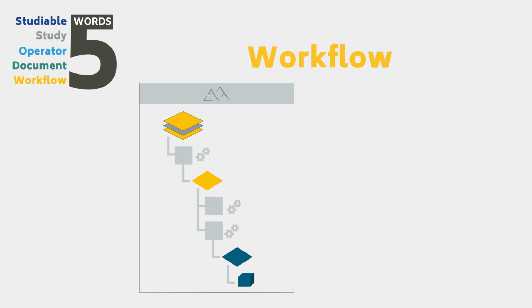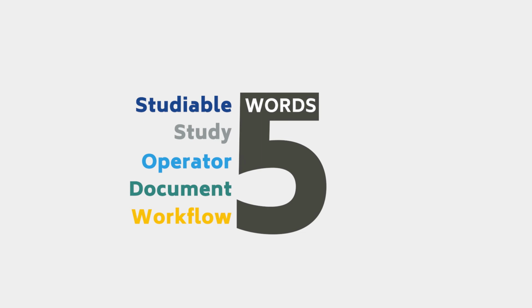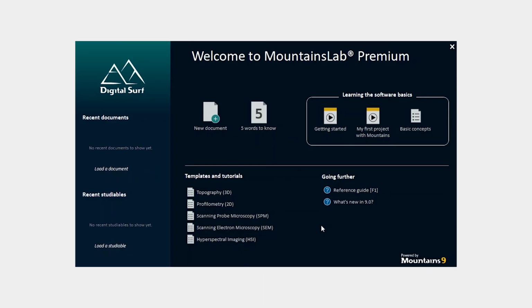The workflow is an interactive tree view of objects in the document, showing the relationship between studyables, operators, and studies. Now that we've mastered the basics, let's open Mountains and create a new document.